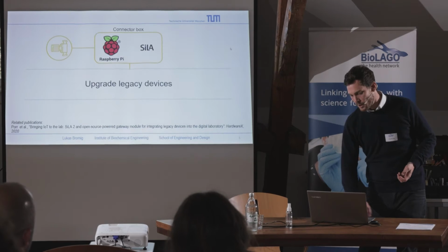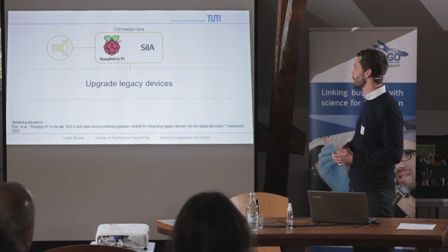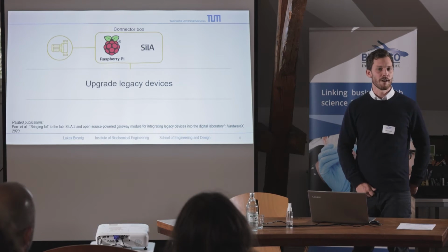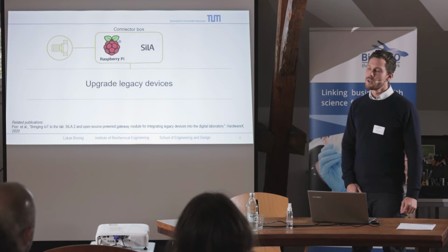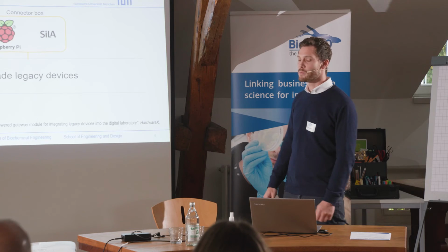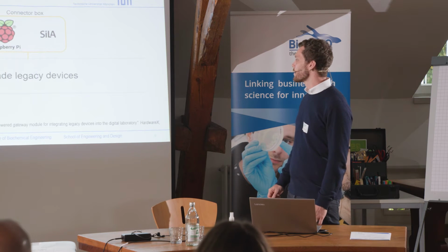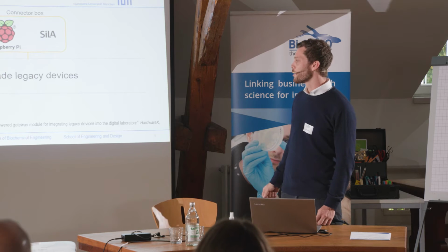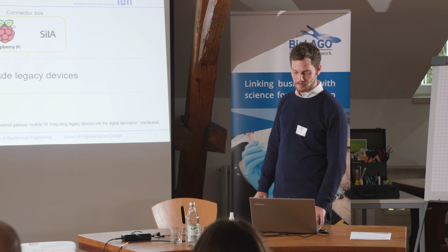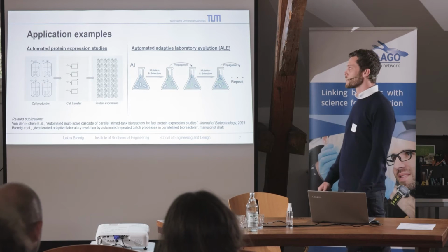research in general. Another small but valuable thing is that we also were able to upgrade lots of legacy devices that didn't really have digital interfaces at all to begin with. We usually do that with low-cost Raspberry Pis that we just install a SiLA driver on. And there's also a nice paper from our colleagues in Hanover where they basically describe how to do that quite easily. So some of the examples that we've used it for was at the very beginning.